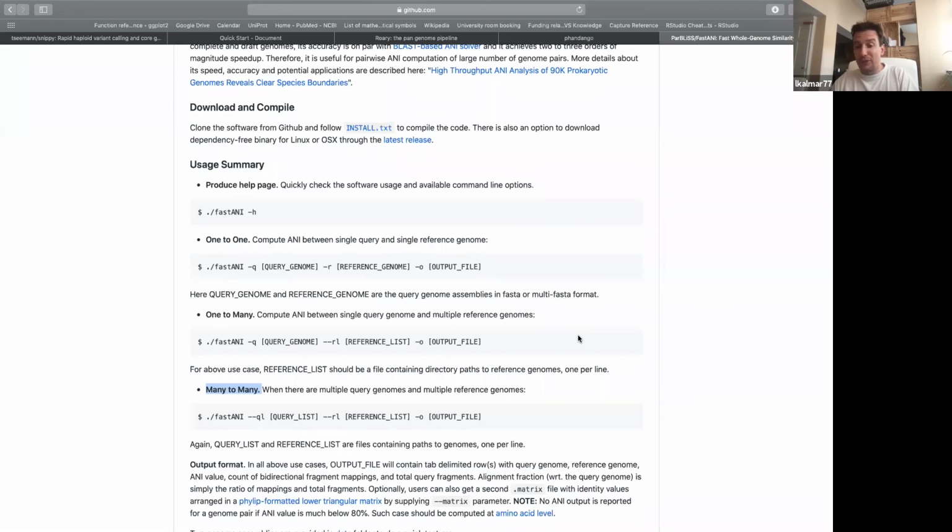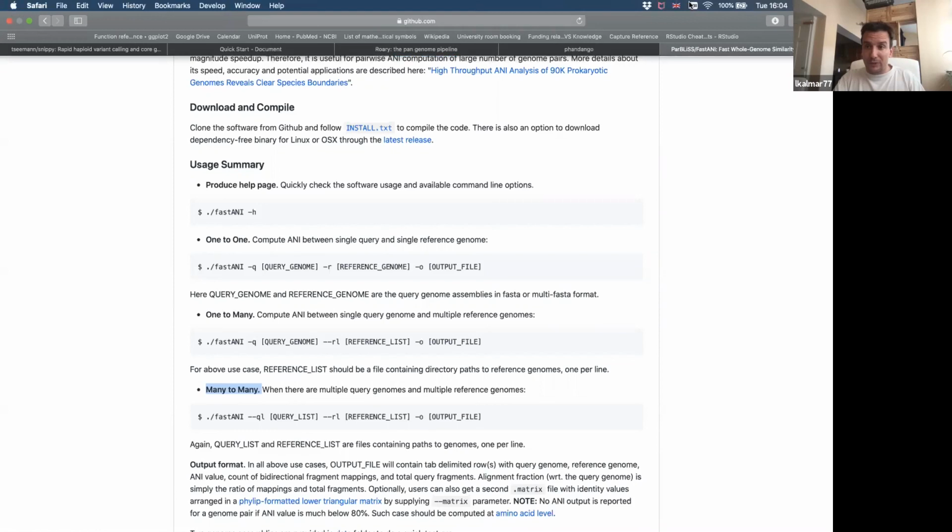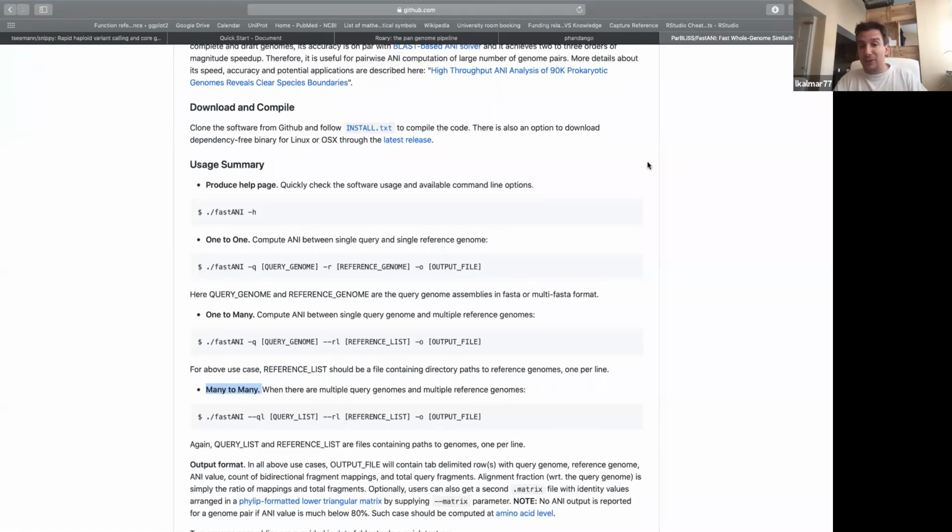You shouldn't go into details of genomes. You don't really want to do any timed tree from a comparison like this, but it is very good for, as I said, comparing a high diversity sample. So I think I will finish here because I already spoke too much. But again, which of the three main approaches you choose depends highly on your aims and your source. Let me just give you the last take-home message.